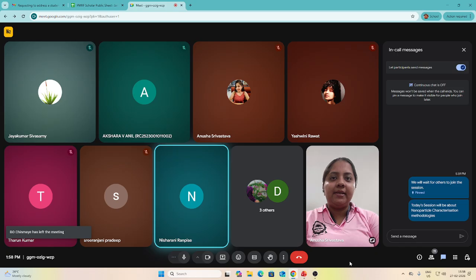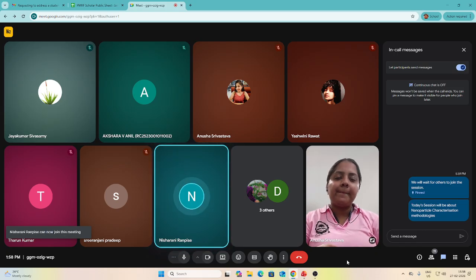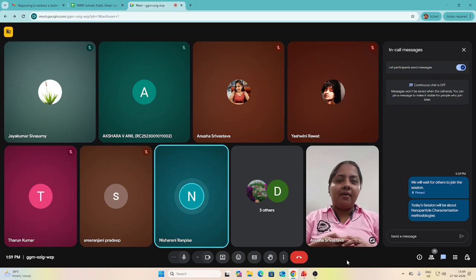Yeah, hello. Yes, I had a doubt. In some papers, they give the zeta potential of the particles, right? Zeta potential is only of the particles. Now, in some papers, they have mentioned the zeta potential of the gel. Is it possible to get the zeta potential of a gel, if you are adding the particles in, say, a polymeric gel like carbopol gel or something like that? Is it possible to measure that?